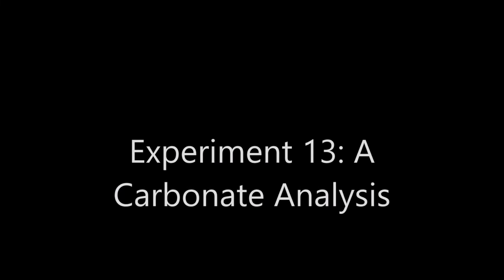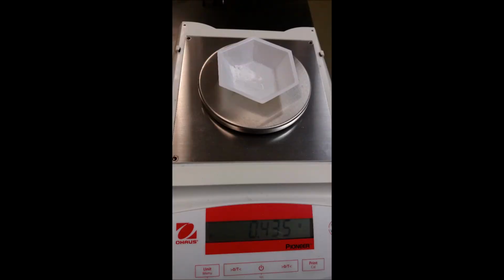This video is for Experiment 13 at Tidewater Community College, Norfolk campus. We start the experiment by measuring out a sample of impure calcium carbonate. This is the mass of sample you should record under Part A1 of your experiment report sheet.